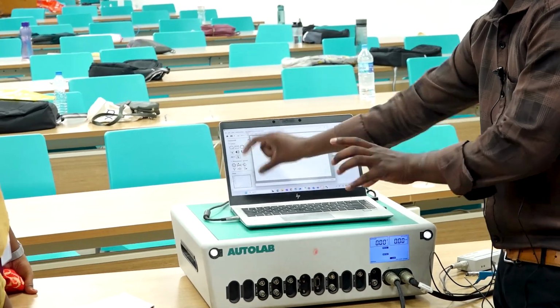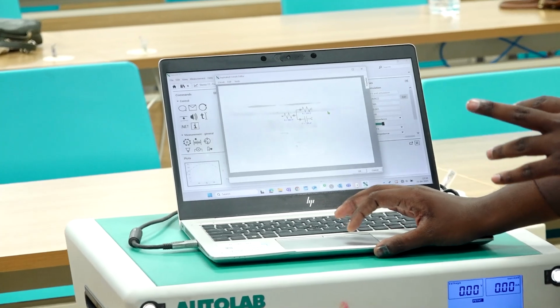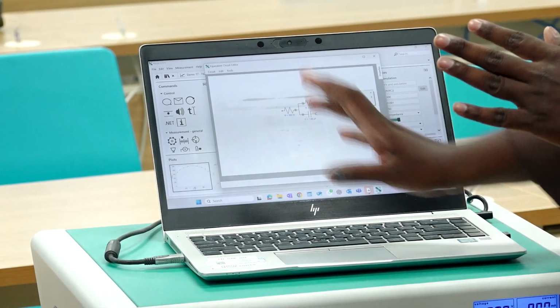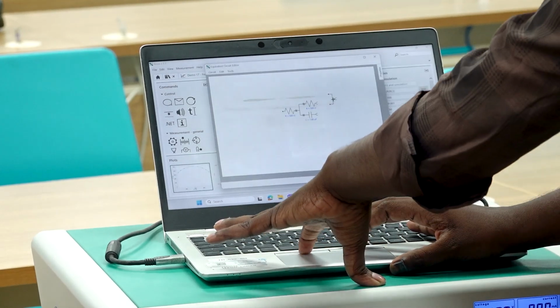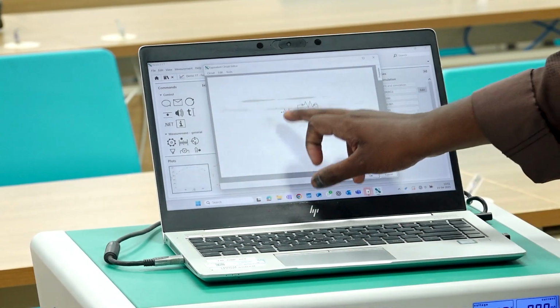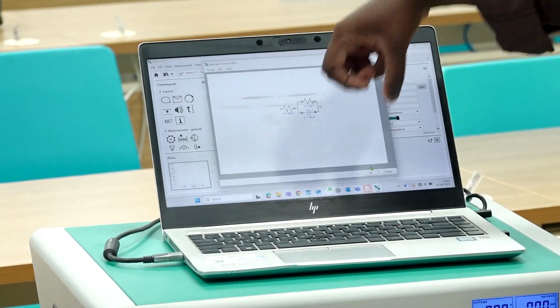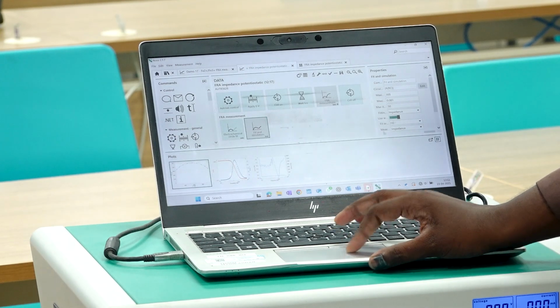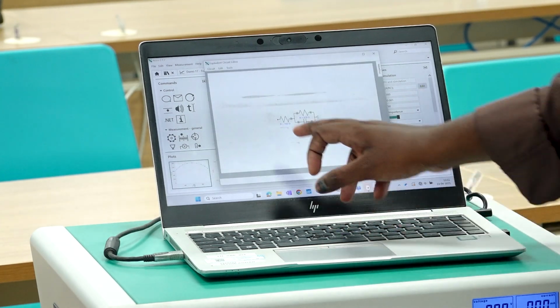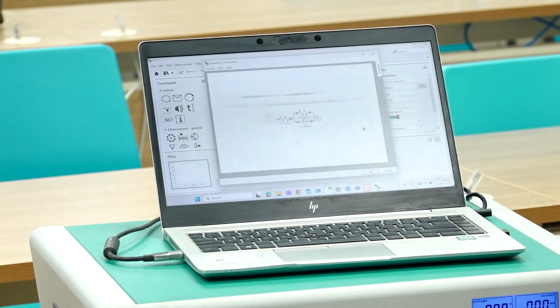So in this graph, that's it: internal resistance, charge transfer, double layer. Okay, so I am going to close the circuit. Add connection, parallel join. Okay, I just closed. These are the default values. Once you click OK, it will get the actual value from the graph. So first let me give OK. Then if you go there, you can see internal resistance, charge transfer and capacitor. So this is how you need to create a circuit.